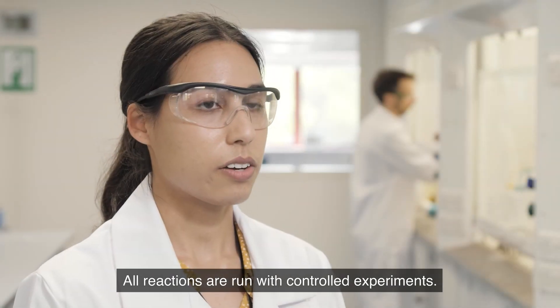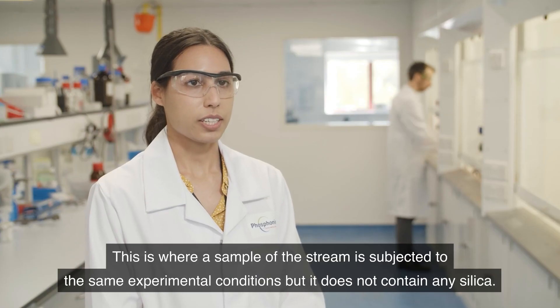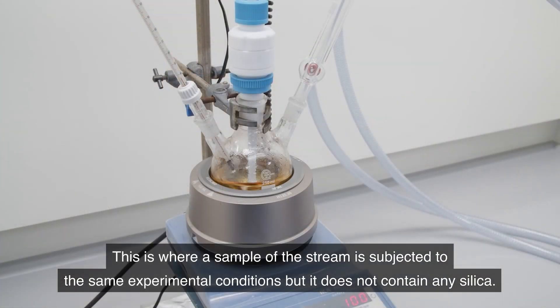All reactions are run with a control experiment. This is where a sample of the stream is subjected to the same experimental conditions but it does not contain any silica.